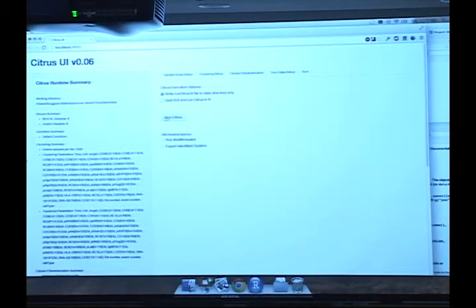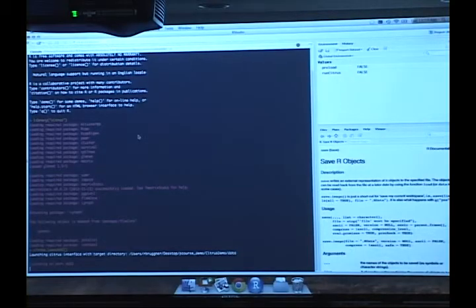And then you hit the run button, and it creates a bunch of output for you, but I do not have time to go through each of the individual outputs. But that's the overview of the software. It's available on GitHub. There are some installation instructions, and I'm also happy, as much as I can, to work with you to try and get it working on your data as well. And so I'll stop there and take any questions.